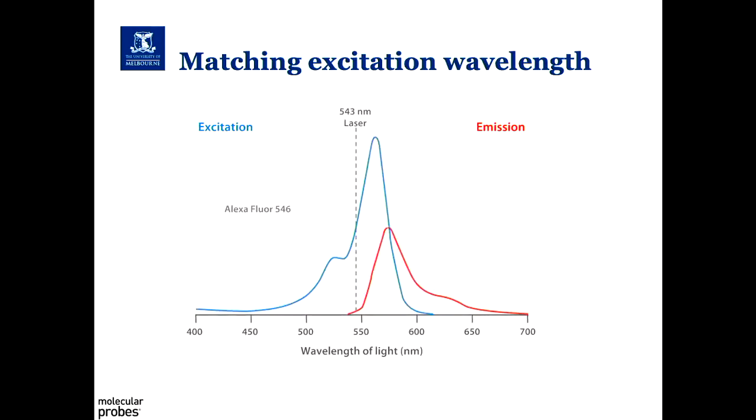So one of the key things when you're setting up your experiments is checking those specification sheets that we have. If you've got a transgenic line that's got EGFP, then you need to know that our system has a 488 laser which will match the fluorophores that you're using. If you have some other bizarre fluorophore, again, it's worth checking what lasers are available, how they match to the excitation spectrum of the fluorophores that you're using. So here we're about 50% emission. If we only have a 520 laser on that, then we're going even lower, down to something like 30% emission. So try and match either your fluorophores to the lasers that you have available, or match the lasers to the fluorophores that you're using. And again, that's one of the reasons we provide those specification sheets for all of our instruments.